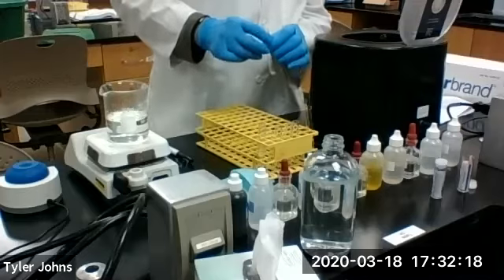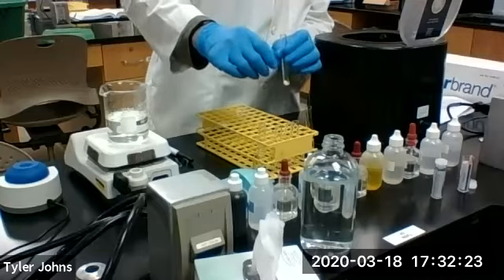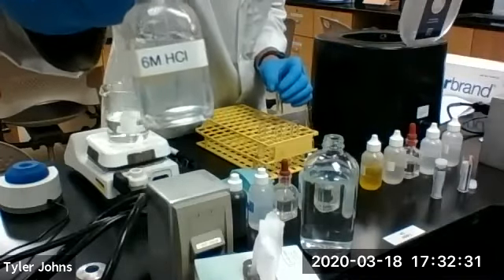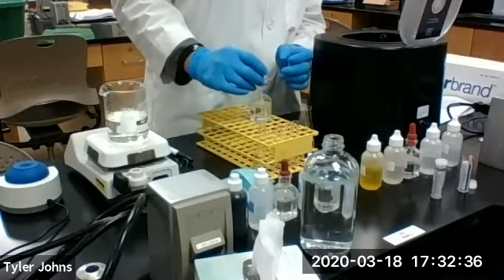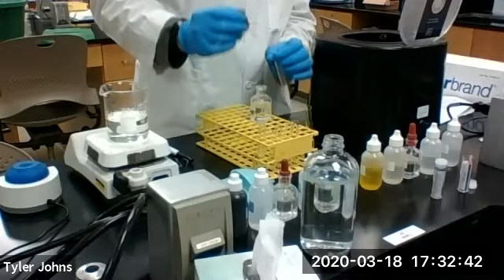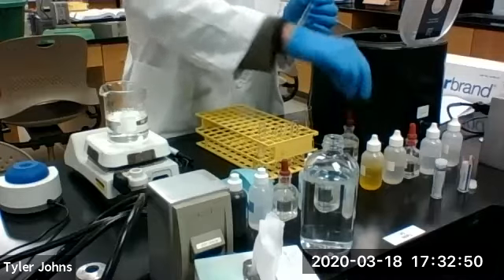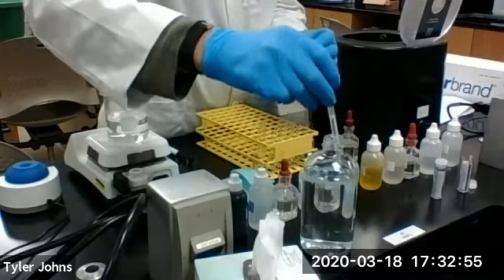And to our white precipitate of calcium oxalate, we're going to add a few drops of 6 molar hydrochloric acid. Here's our 6 molar hydrochloric acid. And we're going to fill to 1 milliliter with water.